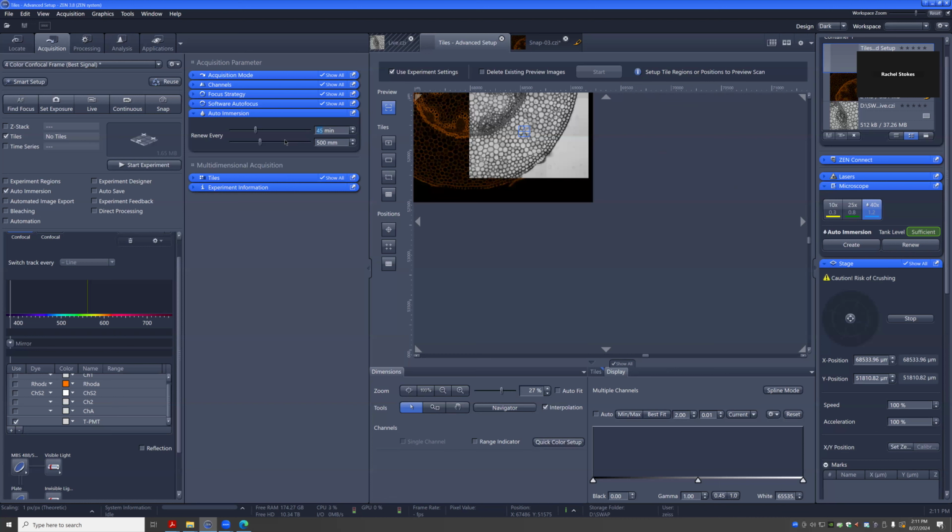The distance depends on if you have something, well, roots are very long. So it's possible. I don't know how often that would be needed, but the 500 millimeters, that's a large, very long, big jump.